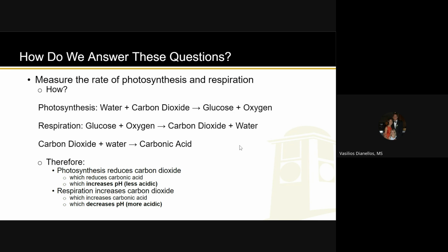So photosynthesis might still be happening, but because the pH indicator, the thing that we're using to measure the pH, isn't able to measure that change, then we wouldn't know, right? So again, the pH might increase to a point where it stops, and that's one of the reasons why that might happen, because we just can't measure any higher.